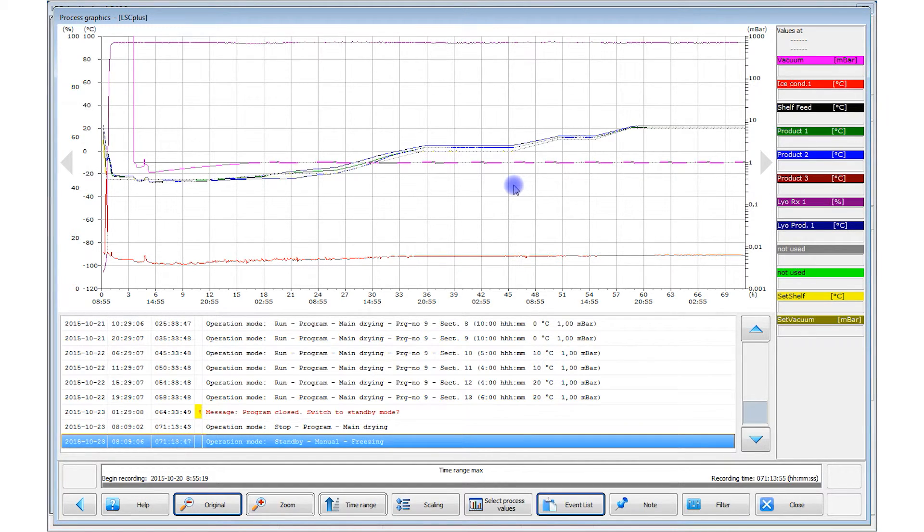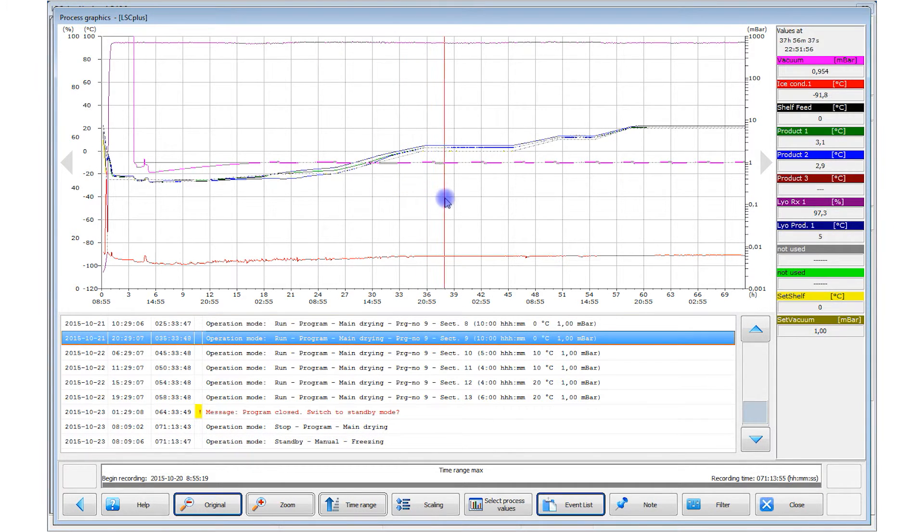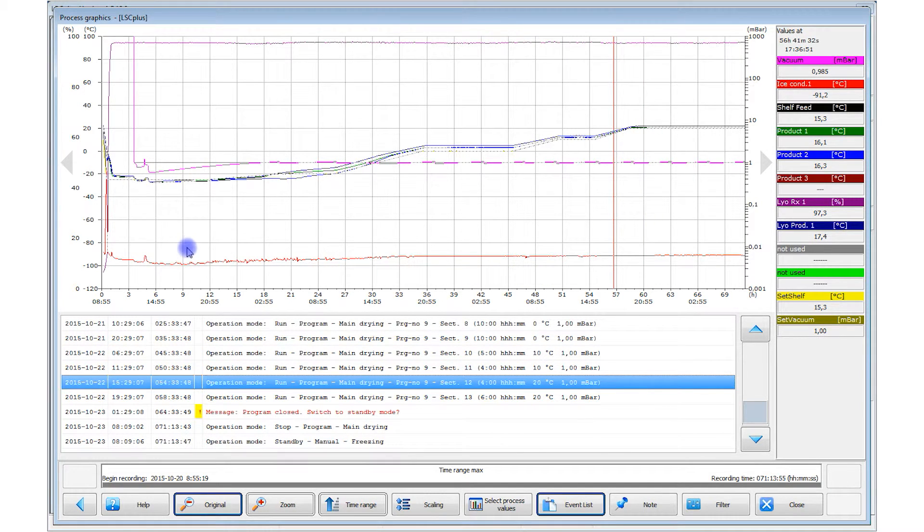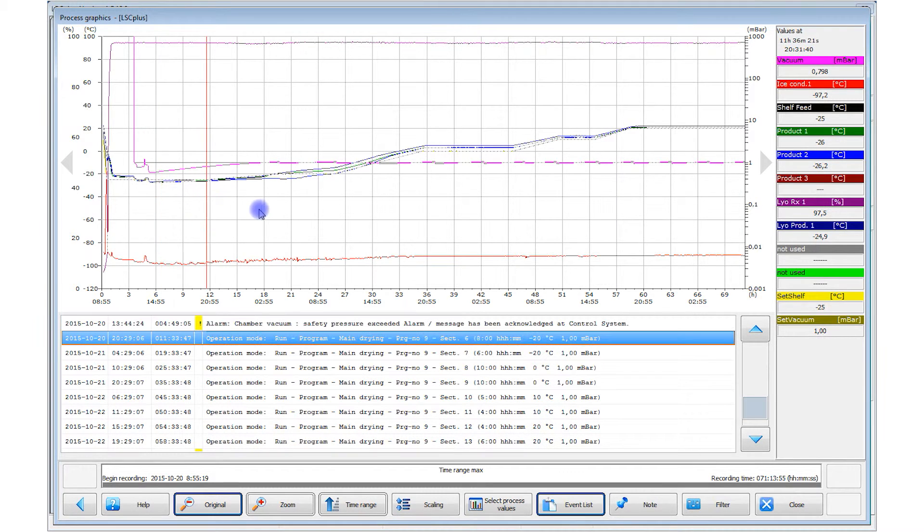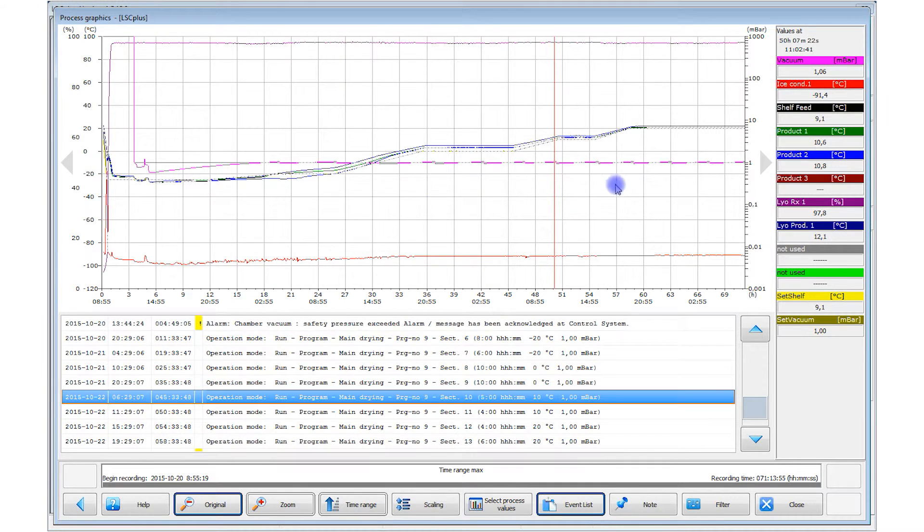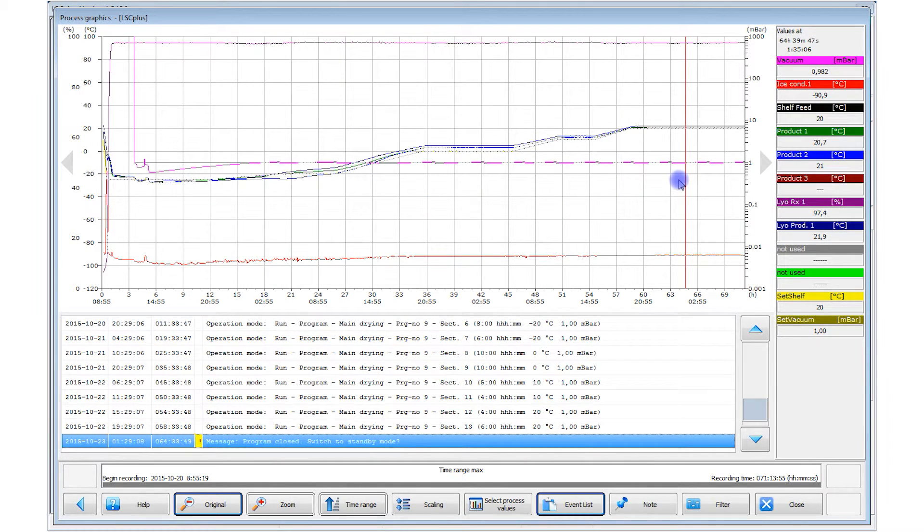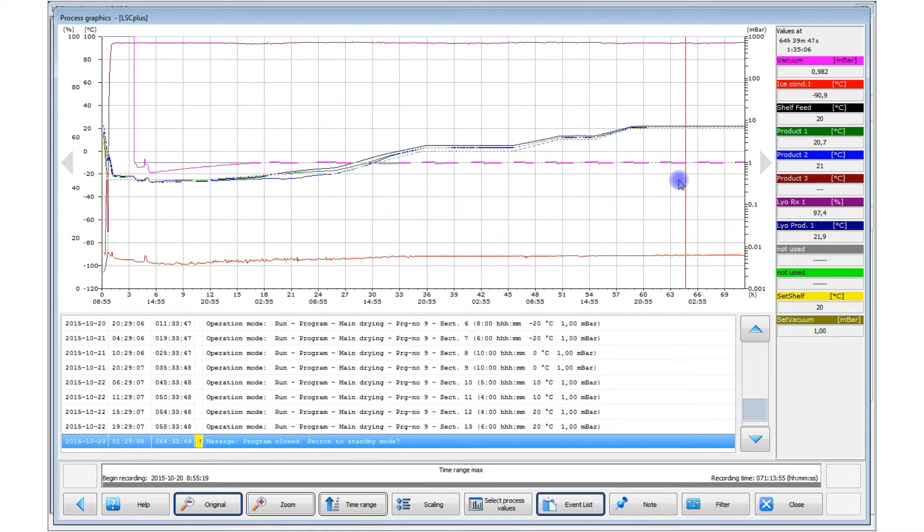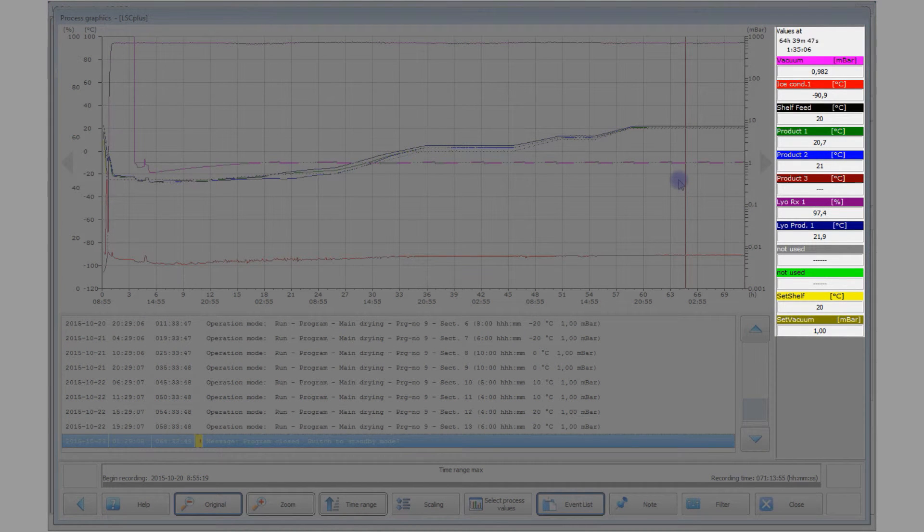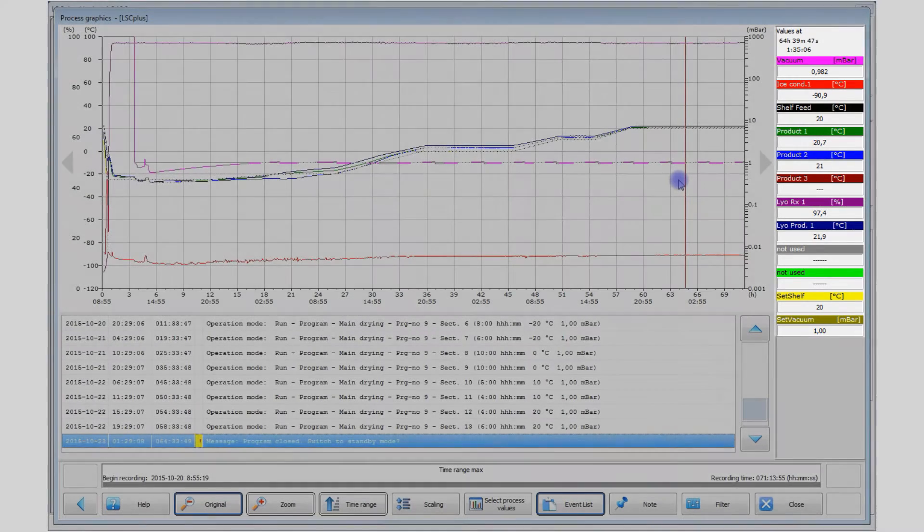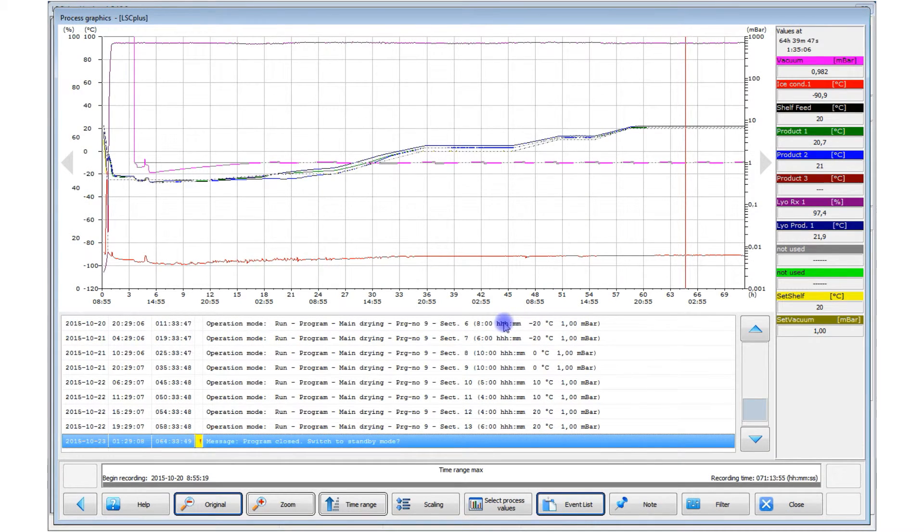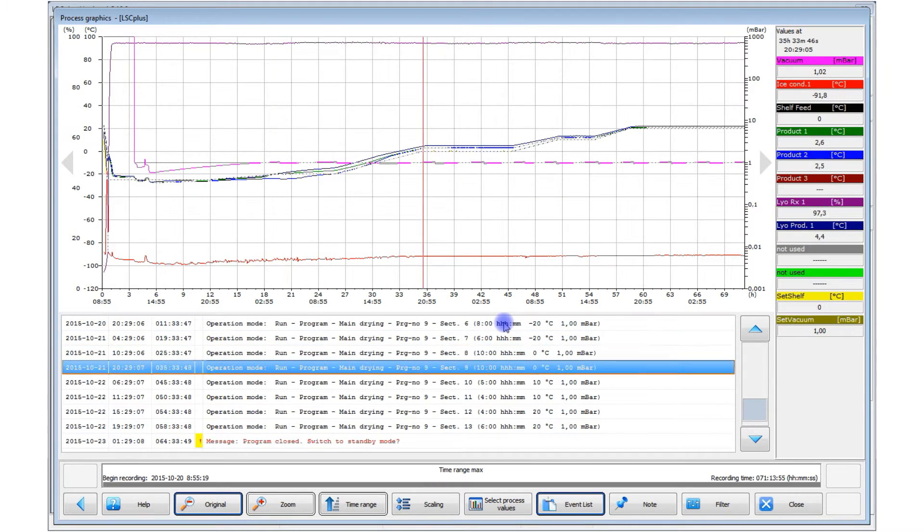Using the red cursor line, you can synchronously scroll through the process graphic and the process events list. Simply click on the process graphic to display the red cursor line. You can move it back and forth anywhere in the process graphic. You can also use the cursor line to view numerical values in the table at any time point. The events list simultaneously jumps to the closest event. You can also select a process event in the list and the cursor line marks the corresponding time point on the graphic.